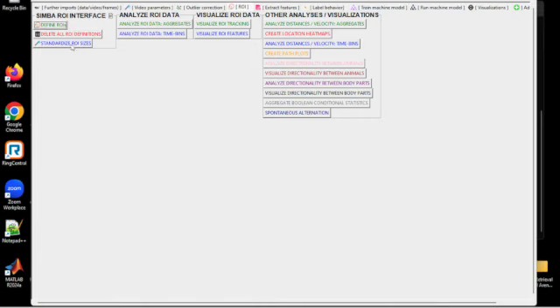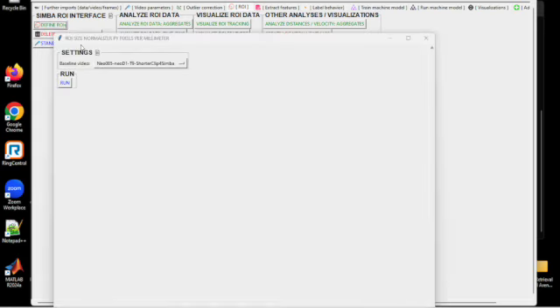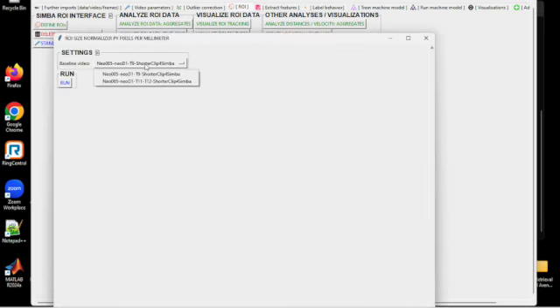And then you can standardize ROI sizes. So essentially that will just make sure that for each video my ROIs are the same pixels per millimeter. Based off of, I'll make this my reference video, and so I'm going to run that. It's important that if you're doing this, it will run it for all of your videos.